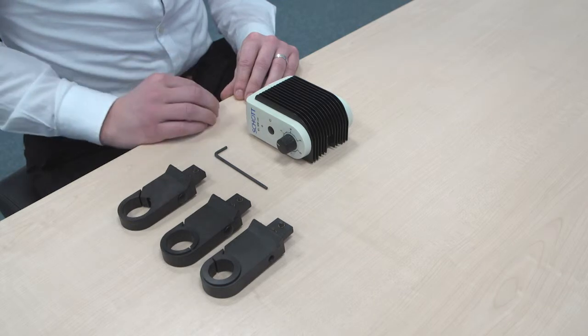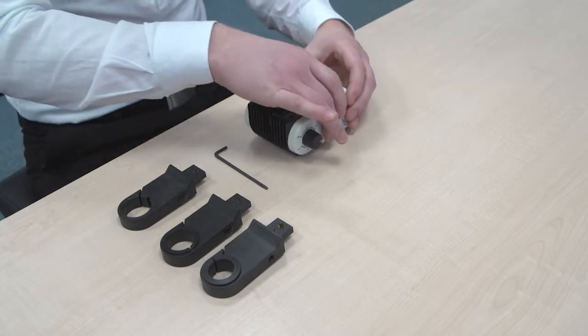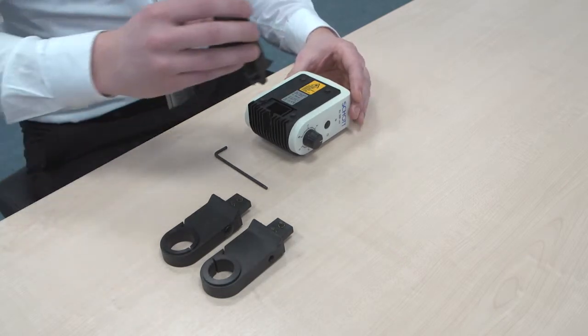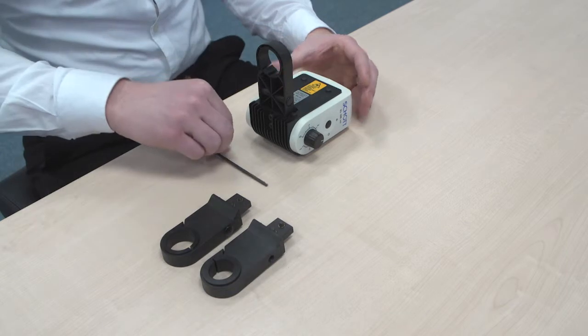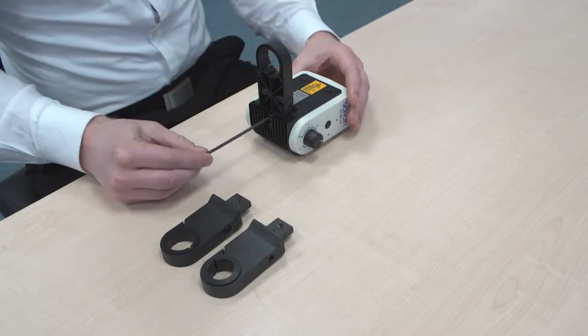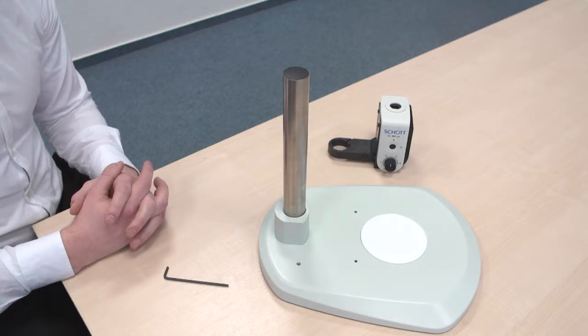Now to connect the connector to the product, simply turn it around and insert it into the back side. Then you'll need to tighten the screws with an Allen wrench. Once you've attached the connector to the KL300 LED, please be sure to remove the microscope head from the stand.